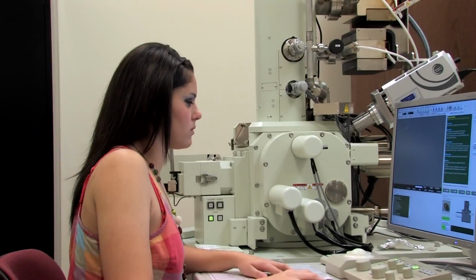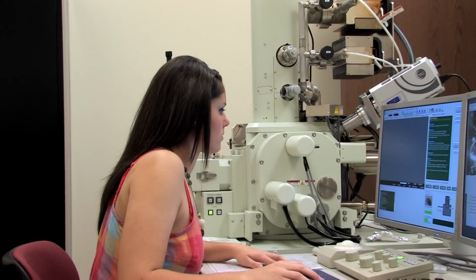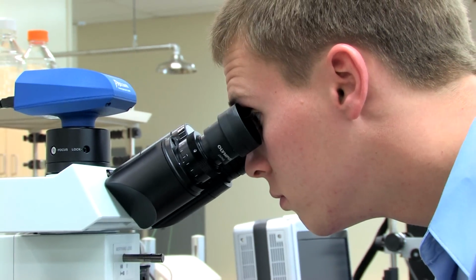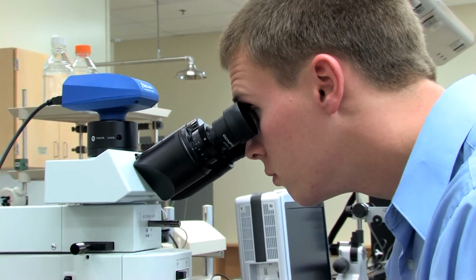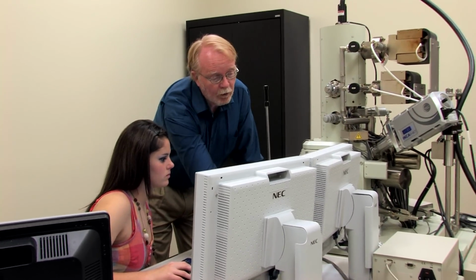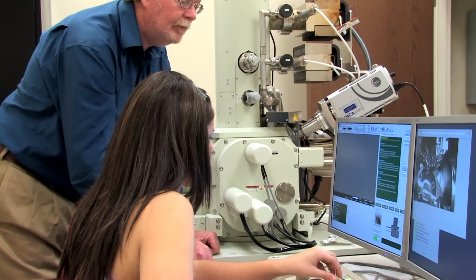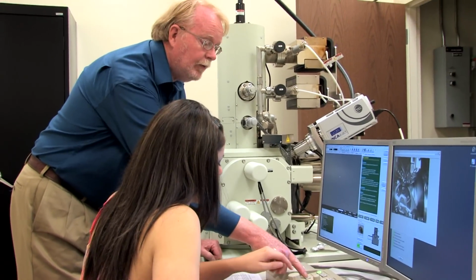A scanning electron microscope is kind of an amazing instrument that we use to image very tiny objects. Light microscopes use glass lenses to focus light. But SEMs use electron beams, because the electrons are much smaller than the light particles to focus. So you can see extremely small objects that way.